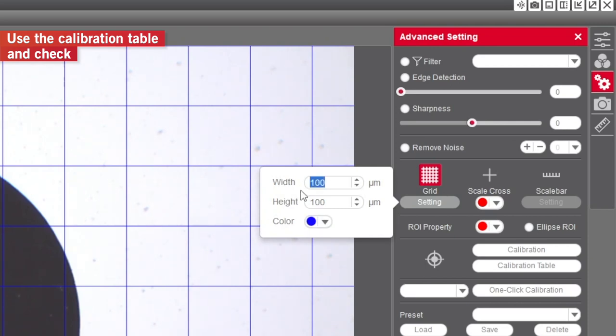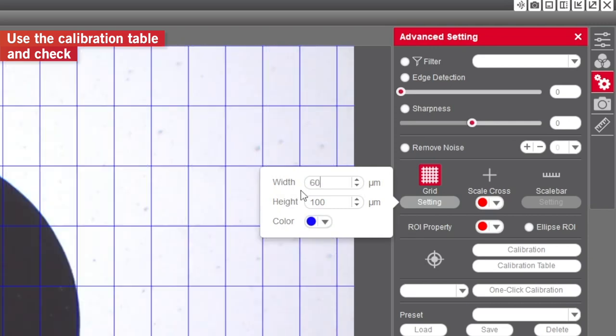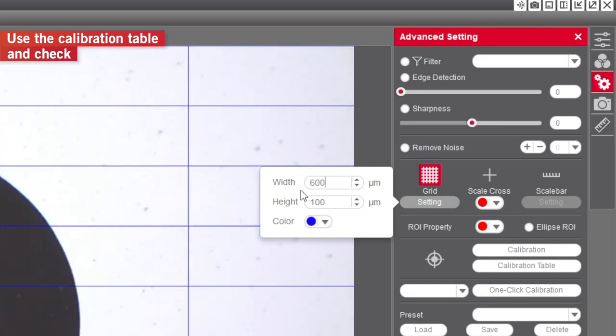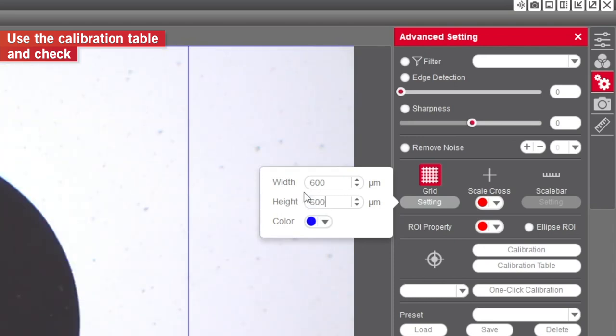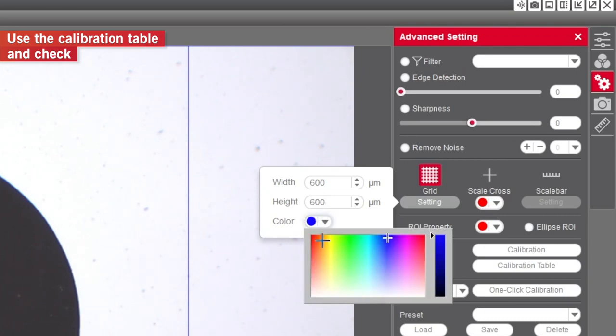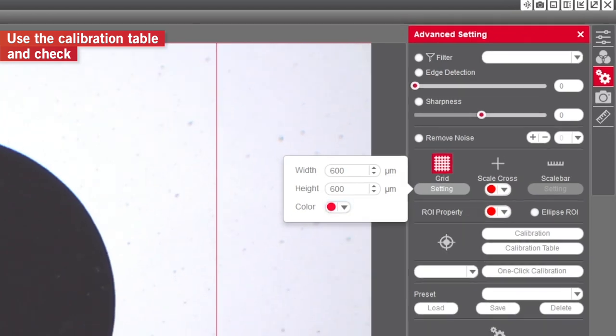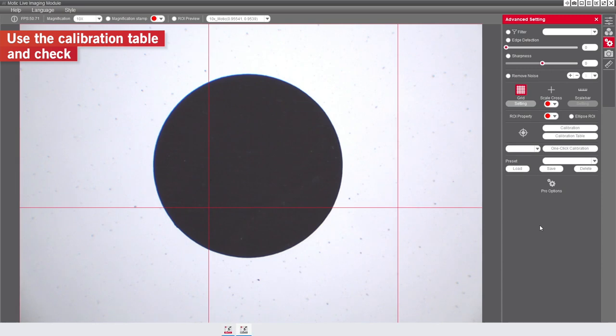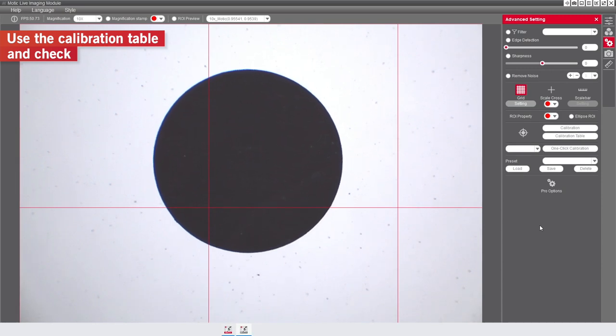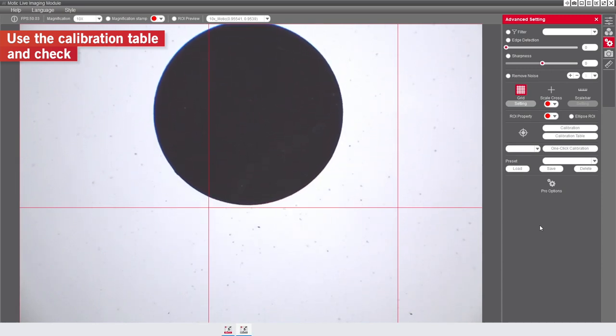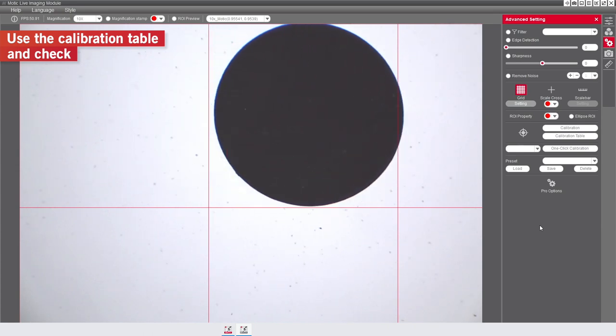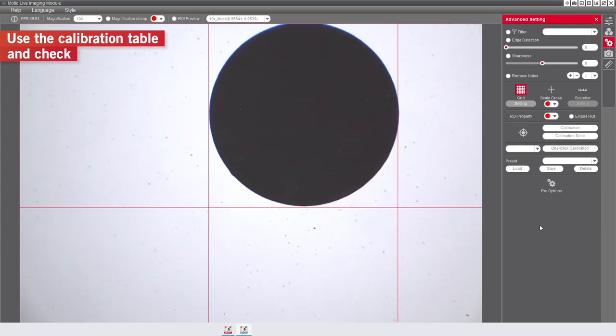Introduce the horizontal and vertical values of the diameter of the dot, in our case 600 microns for width and height, and choose a contrasted color. Finally, check that the dot enters exactly in one of the squares of the grid. This is an easy way to ensure that the calibration is correct.